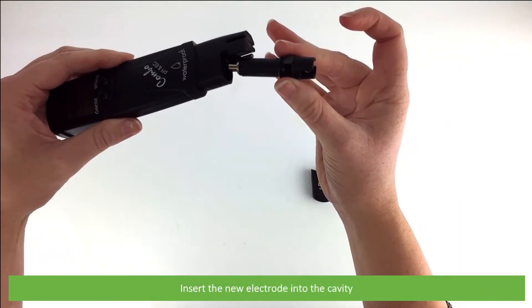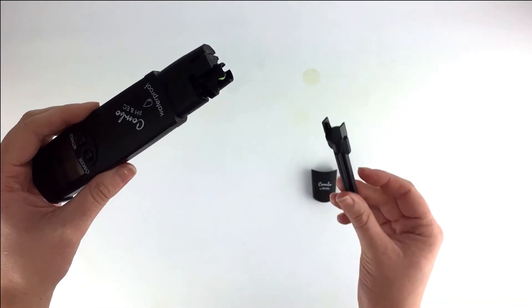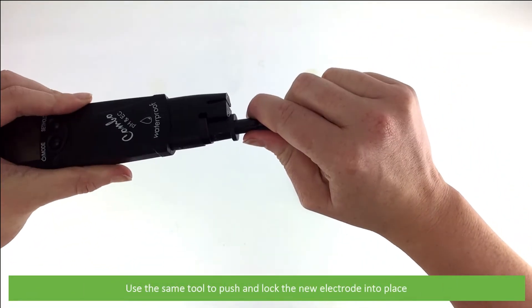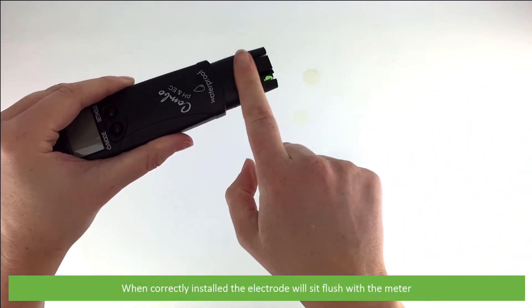Insert the new electrode into the cavity. Then use the same tool to push and lock the electrode into place. When correctly installed, the electrode will sit flush with the meter.